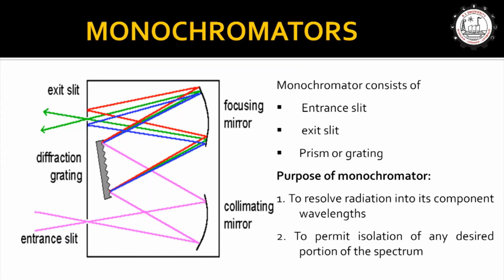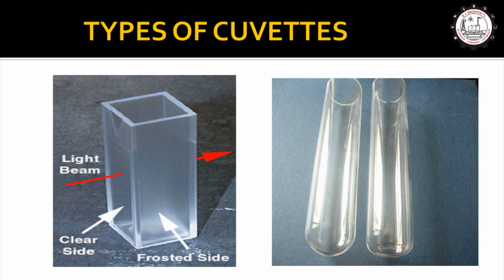Then the monochromator. The monochromator is a basic accessory in UV visible spectroscopy, which is helpful for converting polychromatic light to monochromatic light. After that, the monochromatic light falls on a sample holder, which is made up of a cuvette or glass, in which we can put the chemicals. So chemicals and pharmaceutical preparations. So the sample will absorb the light.